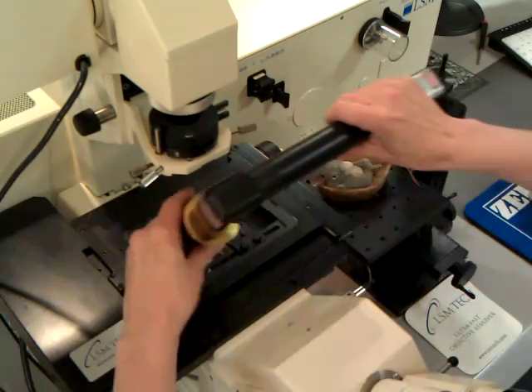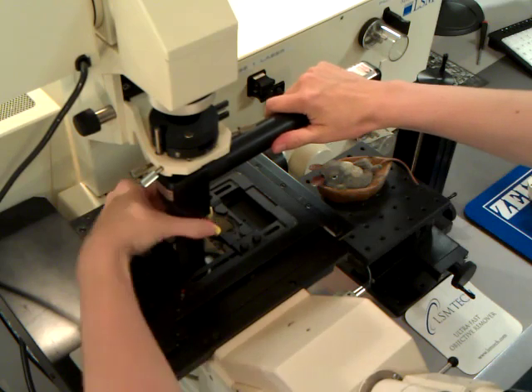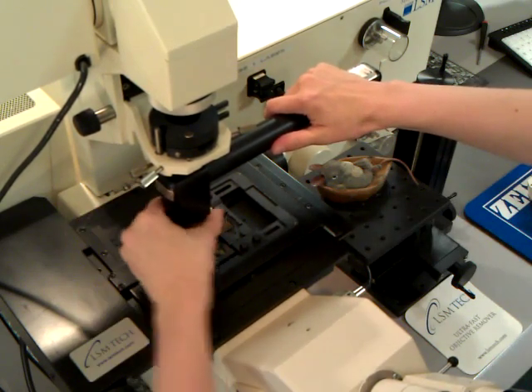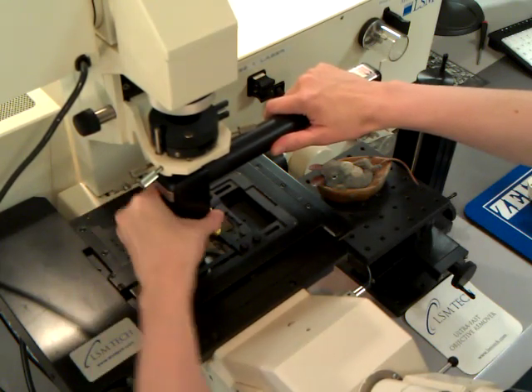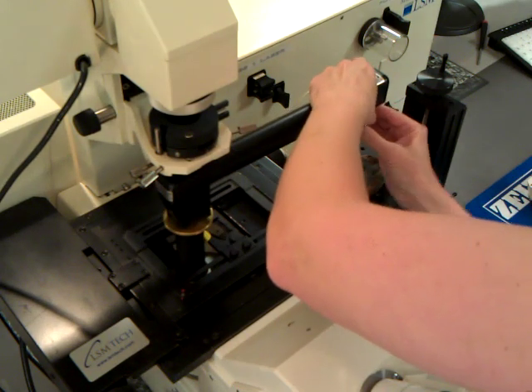Next, you install the objective inverter in the objective hole by turning the brass ring clockwise, being careful not to over tighten. Then install the objective into the opposite end of the objective inverter.